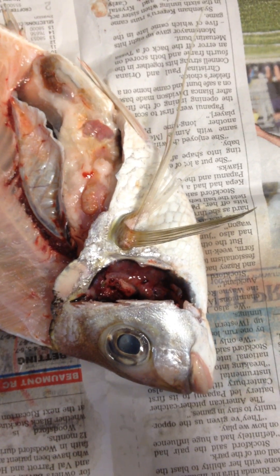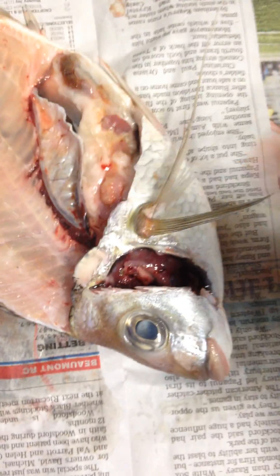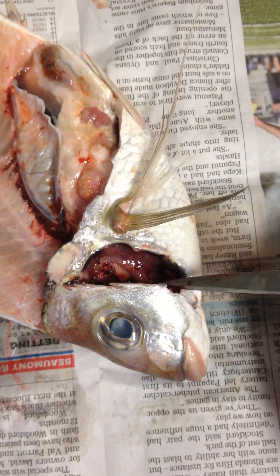In Year 12 Biology today we're dissecting gills and fish, and it looks like we've got some nice snapper here from a local fish shop. This is the operculum, just here.